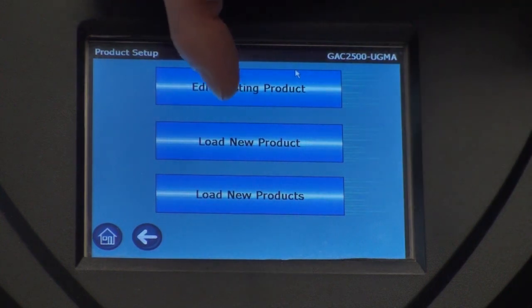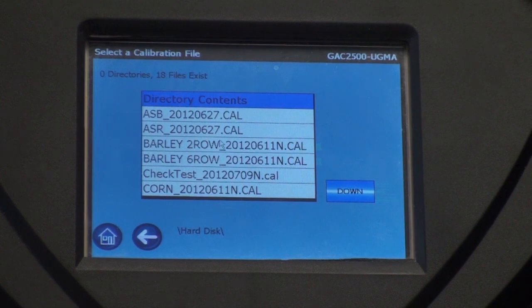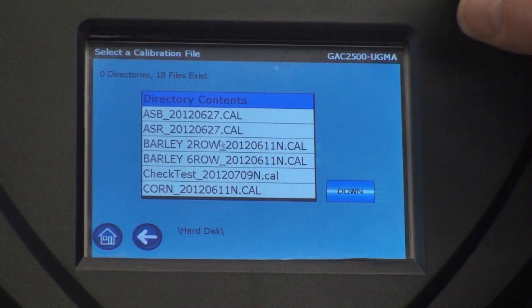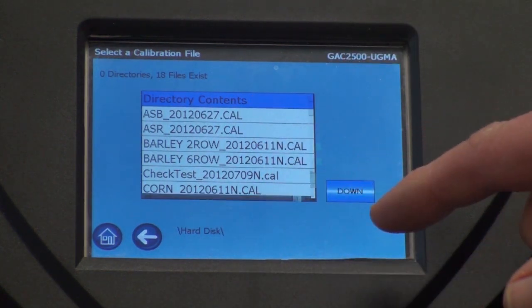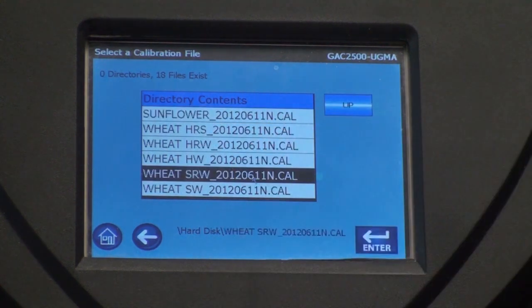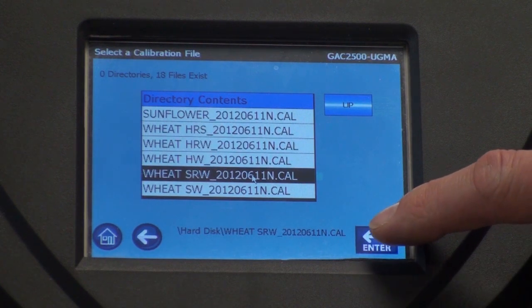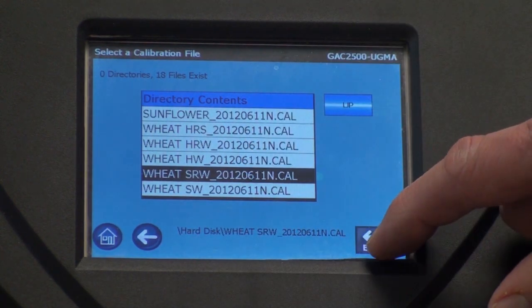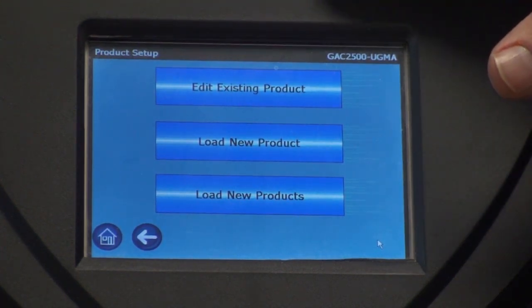We're going to load a single product first, so I will press that one and you will see the directory of this USB drive come up on the screen. Choose the product you want to load — you can cycle down through the menu until you find that particular product. You choose it, and you will now see an enter button. If the proper file is highlighted, press enter and it loads right onto the machine and goes back to that particular menu.